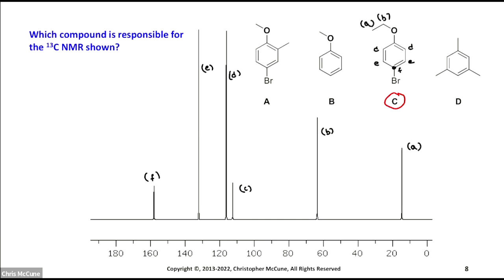And that's really the best information you're getting from the carbon-13 NMR for this type. There are other types of carbon-13 NMRs that we're not talking about, including DEPT NMRs, which show peaks above or below the chemical shift axis as being up or down based upon whether they're CHs, CH2s, or CH3 carbons. Okay, but those are outside the scope of this video.